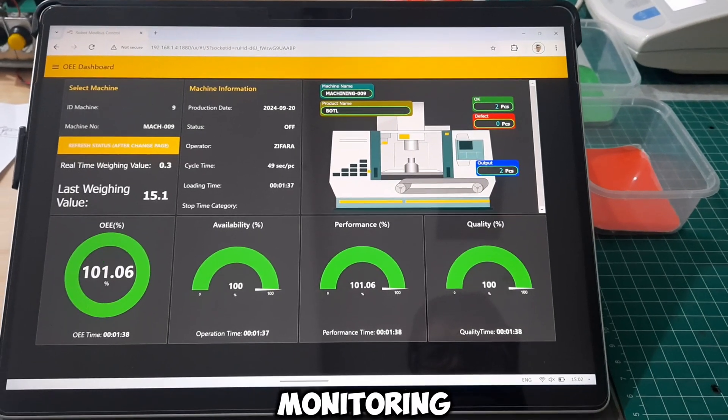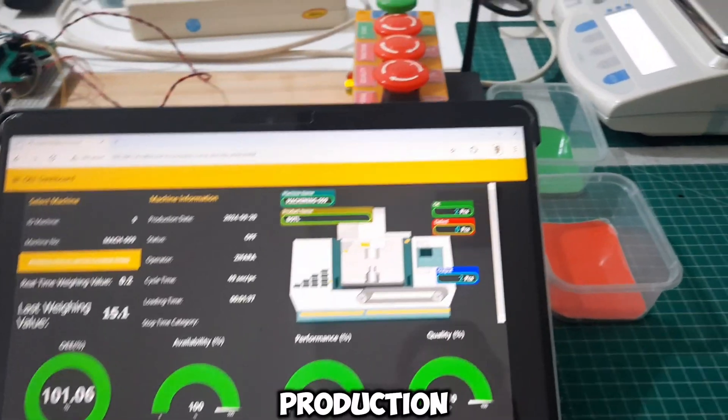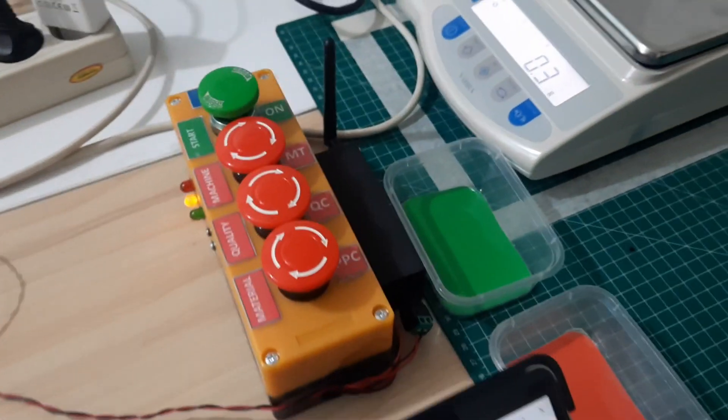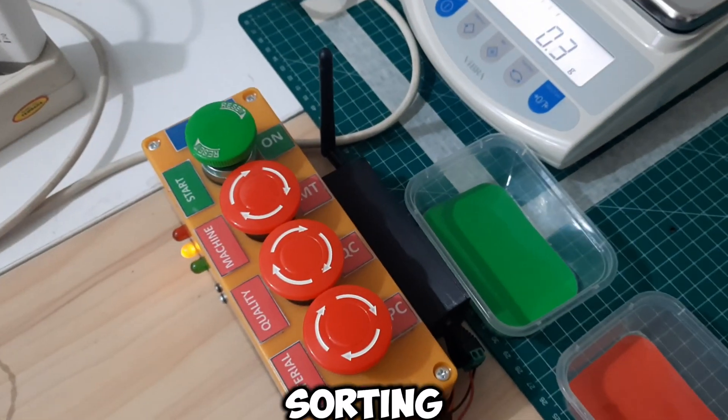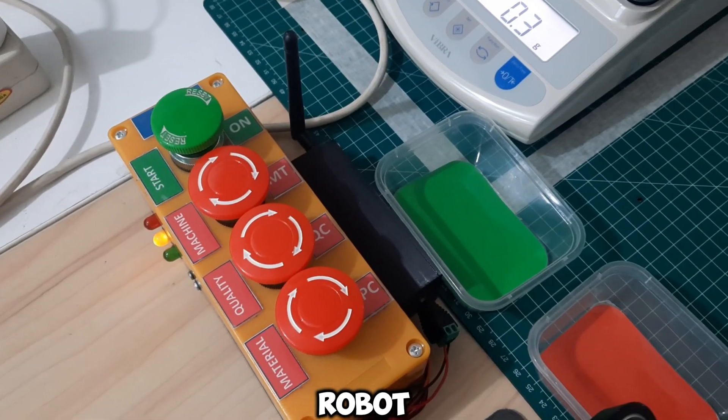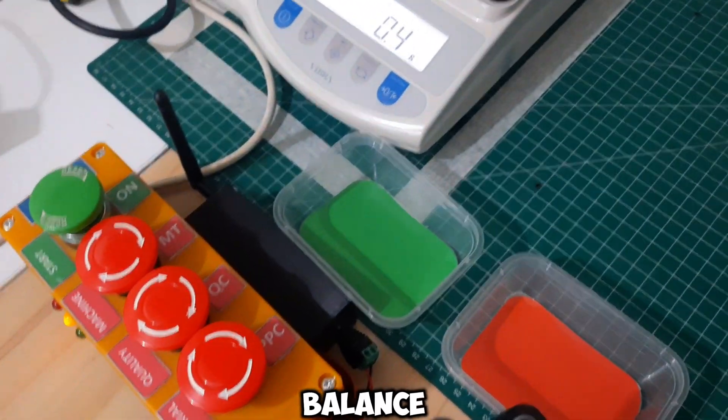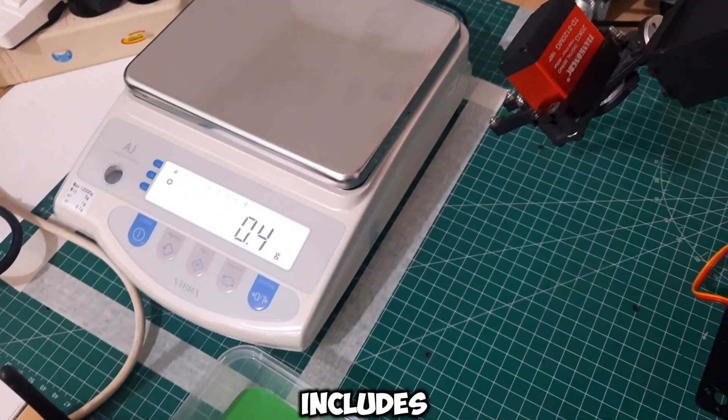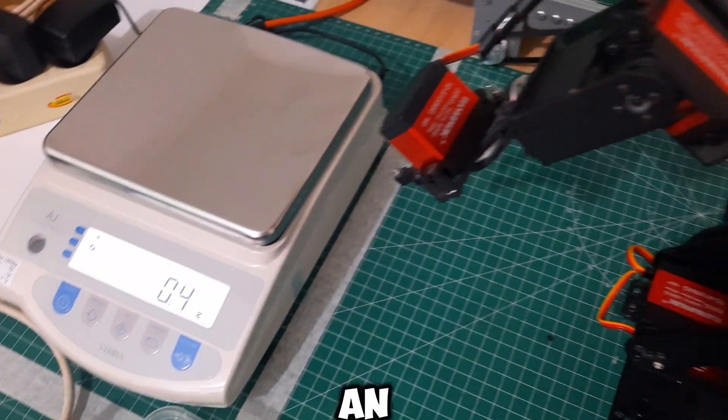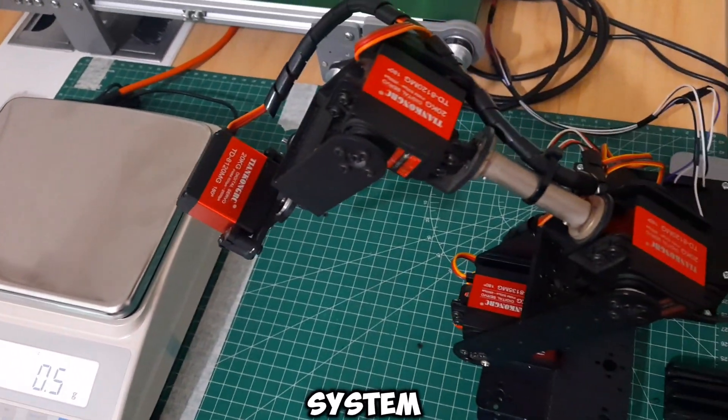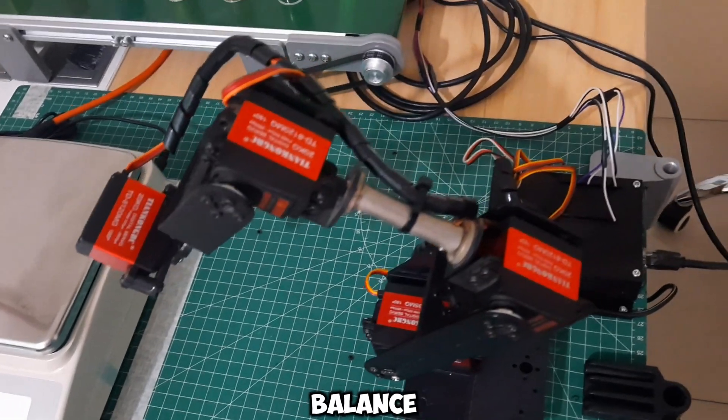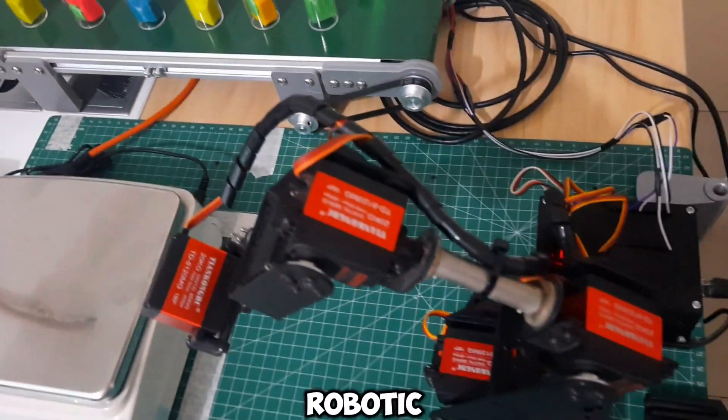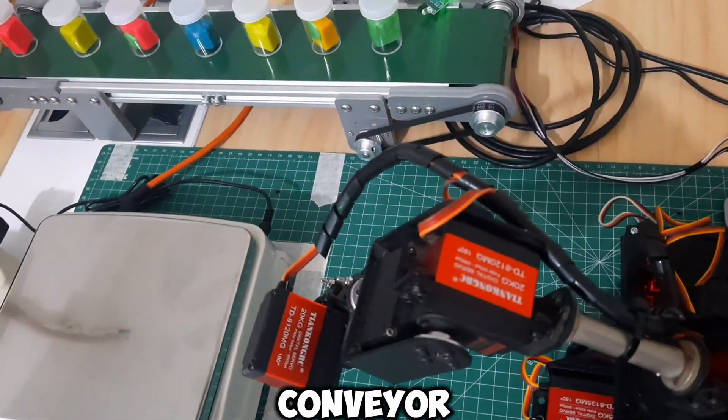This is an OEE monitoring system with a production simulation involving weighing and sorting using a robot and an analytical balance. It includes a dashboard, an Andon system, an analytical balance, a robotic arm, and a conveyor.